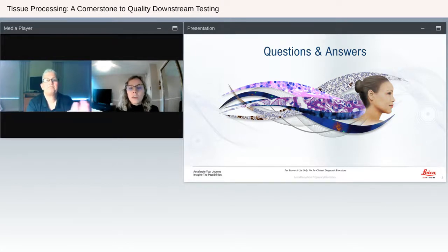Great. And it looks like Alexandra tried to clarify the question. Yeah. So the question was, how would you handle fresh tissues? And they said that it's fresh tissue for cryosectioning. Oh, that's what I wondered. Yeah. It's pretty much the same technique as paraffin. If you have long tissue, cut it at an angle to take the impact off the blade, and keep it near the center.